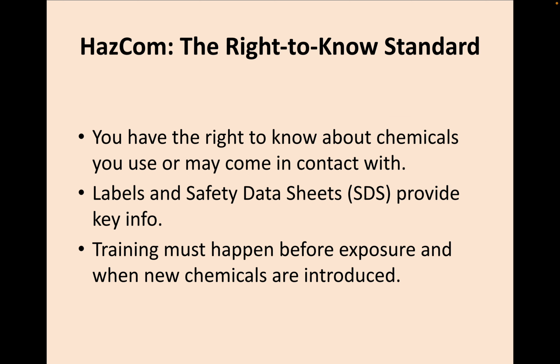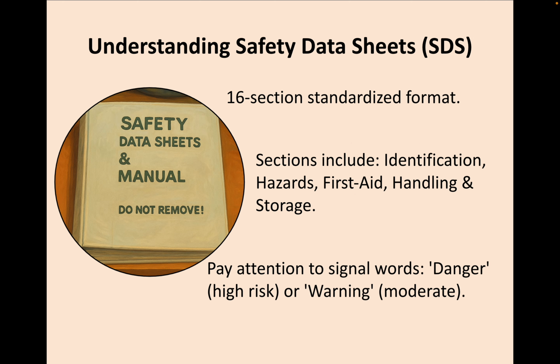The Hazard Communication Standard, or HAZCOM, gives you the right to know about every hazardous chemical you may be exposed to. This includes how it can hurt you, how to protect yourself, and where to find more information, like labels and SDS sheets. This training must happen before exposure and when a new chemical comes into the mix.